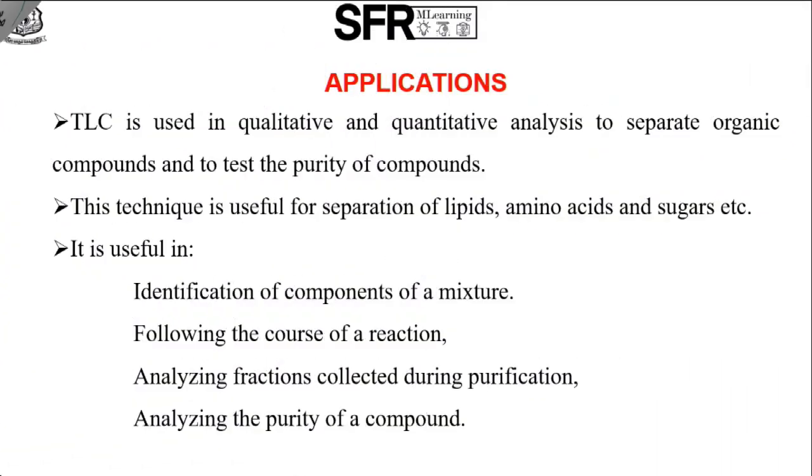Next we are going to see the applications of TLC. This technique is used in qualitative and quantitative analysis to separate organic compounds and to test the purity of compounds. It is useful for separation of lipids, amino acids, sugars and so on. It is useful in identification of components of a mixture, following the course of a reaction, analyzing the fractions collected during purification, and checking the purity of a compound. So that is all about the applications of TLC.